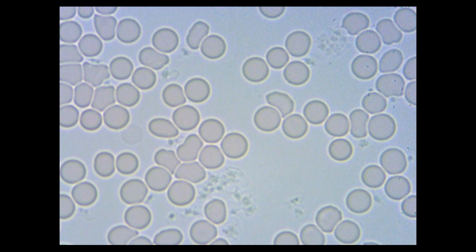People often ask about the effects of climatic conditions, if it's really a damp environment that a person's working in, and whether there's a risk of fungal growth on the lens components. Well, most microscopes, and certainly the ones that we supply, have a type of treatment on the lenses to actually prevent that from developing.